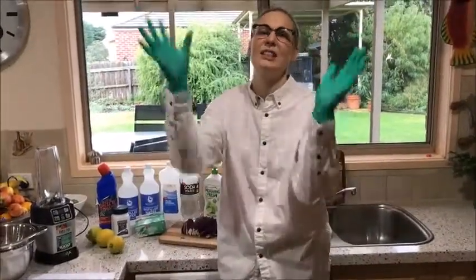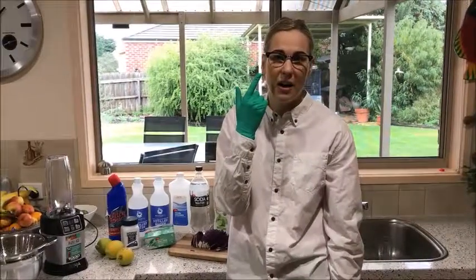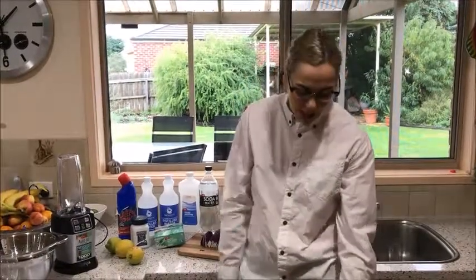Also, obviously, when conducting any experiment in the home or the lab, we need safety precautions. So today I'm wearing gloves, an old shirt to protect my skin, glasses to protect my eyes. Always make sure, girls or boys with long hair, that you have it tied up, and always wear enclosed shoes.